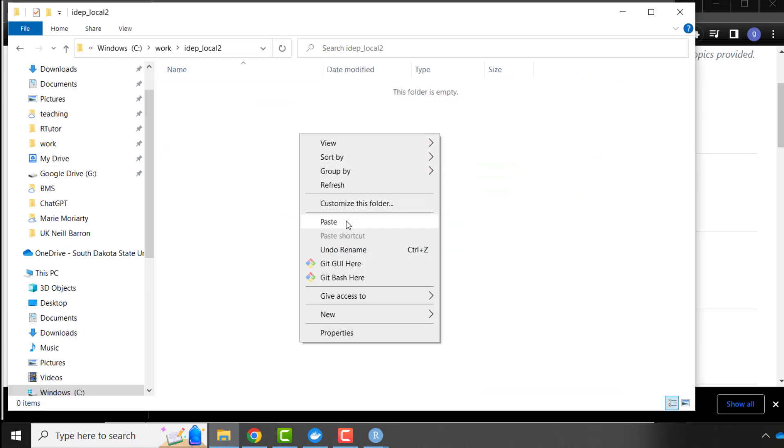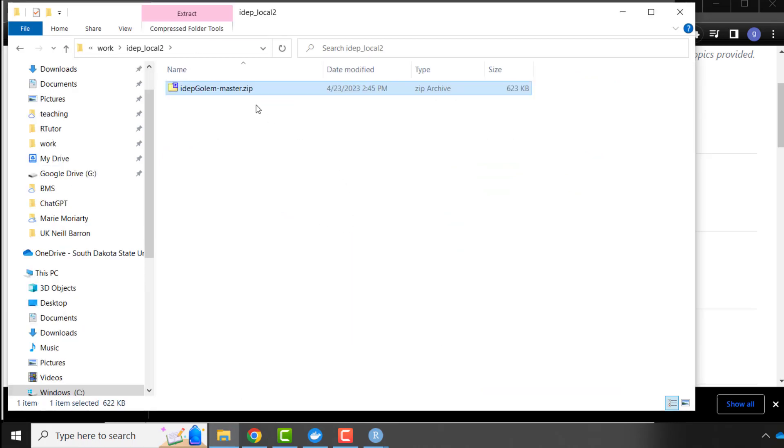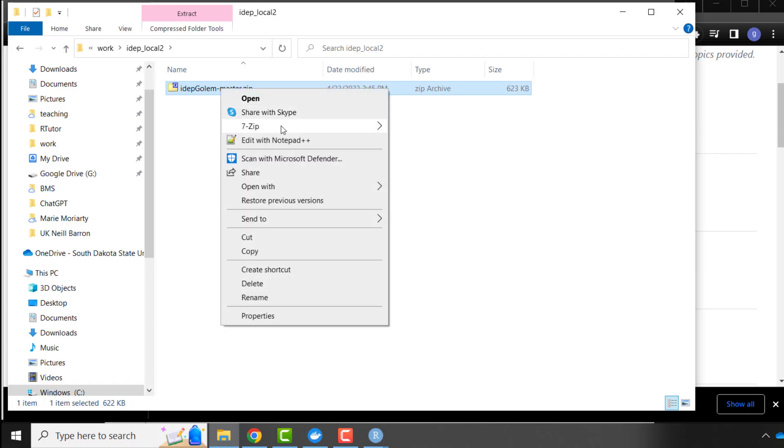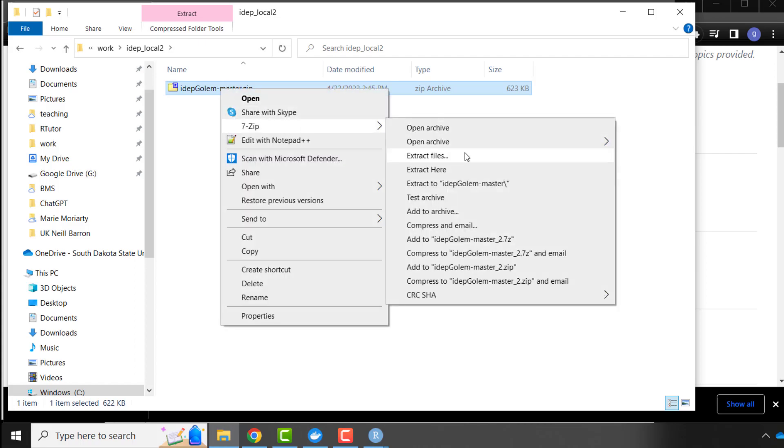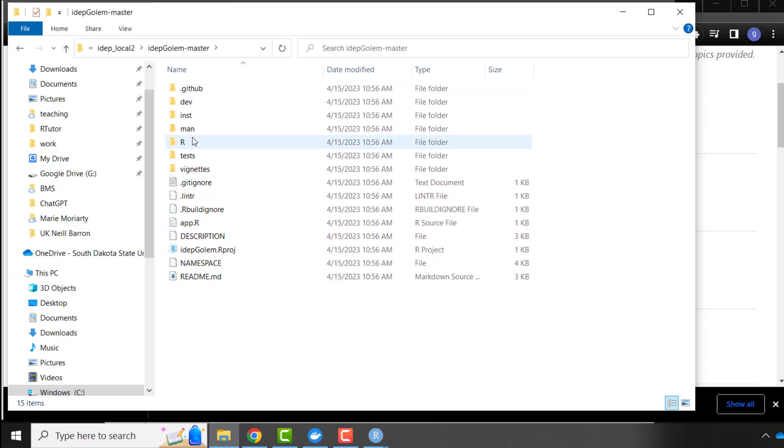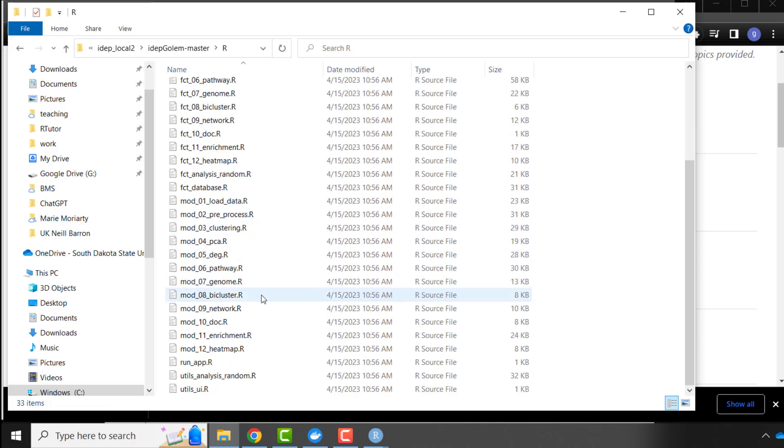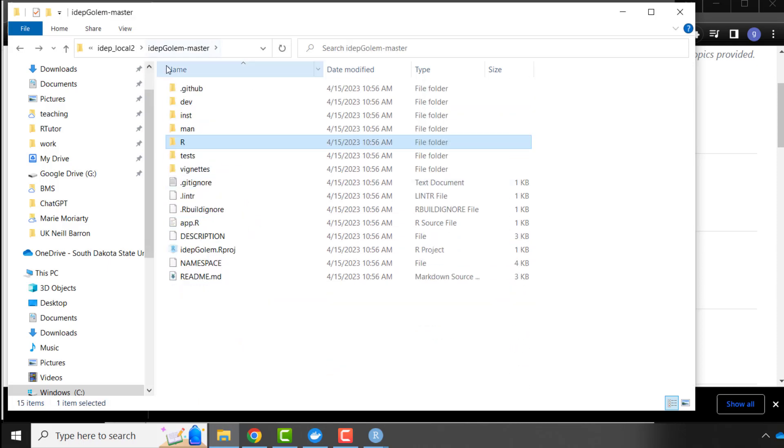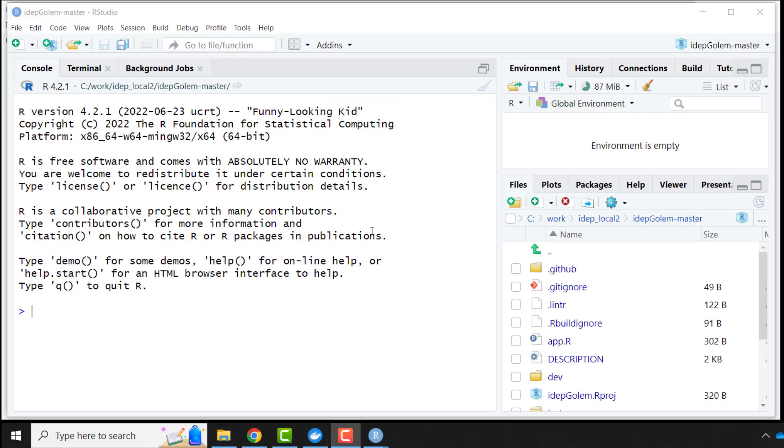And I paste everything. Paste the file. I unzip here. After I unzip here, you can see all the files are here. And from here, all you need to do is to figure out a way to run this app. This is a lot of scripts.